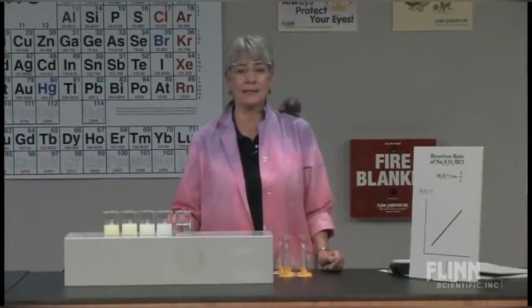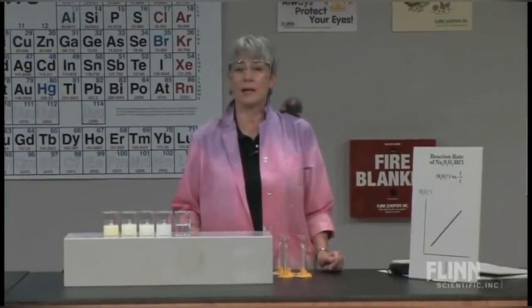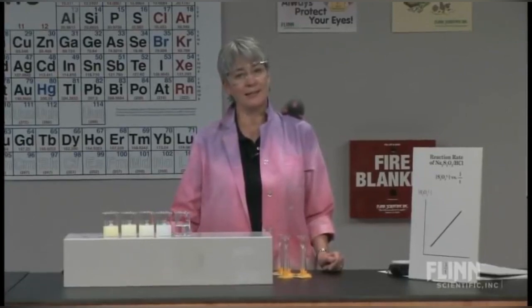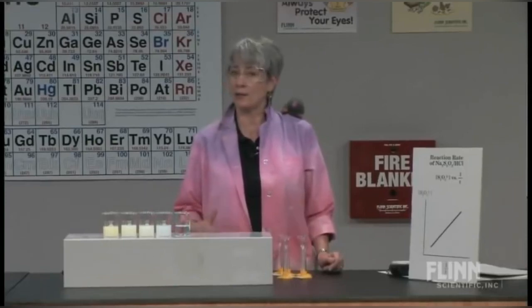We kept the acid constant. Let's see, could you tell me how to alter the experiment? And that would get them thinking about variables, that they'd have to hold everything constant except for the HCl concentration, and they could make a similar graph of that.